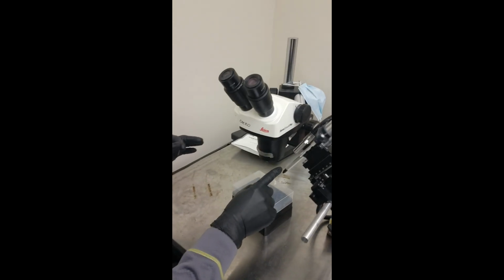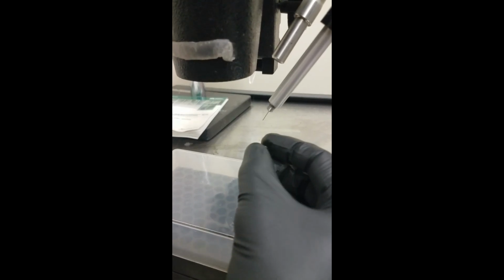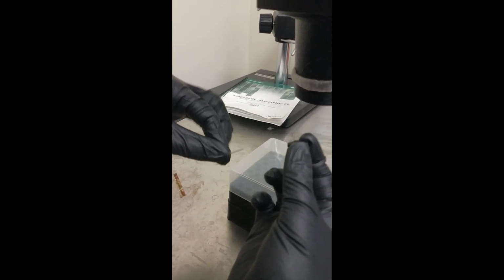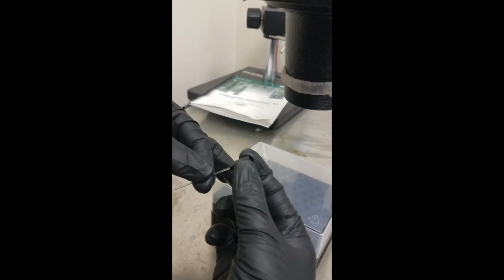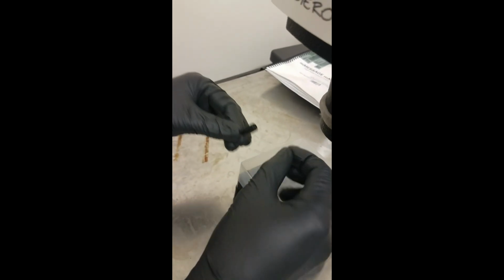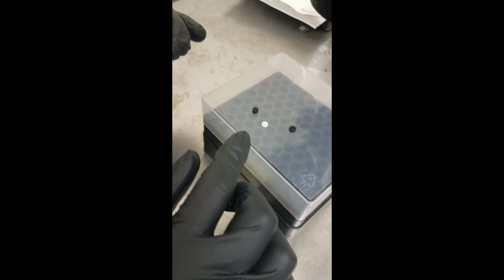So first, if you wanna look right here, you unscrew this little black tip, and inside are 3 pieces. Those 3 pieces come out when you put the tip into this way. And then you can push out those 3 little pieces. I'm going to lay them out here so you can see them. Black, white, and black again. They have different size holes in them.